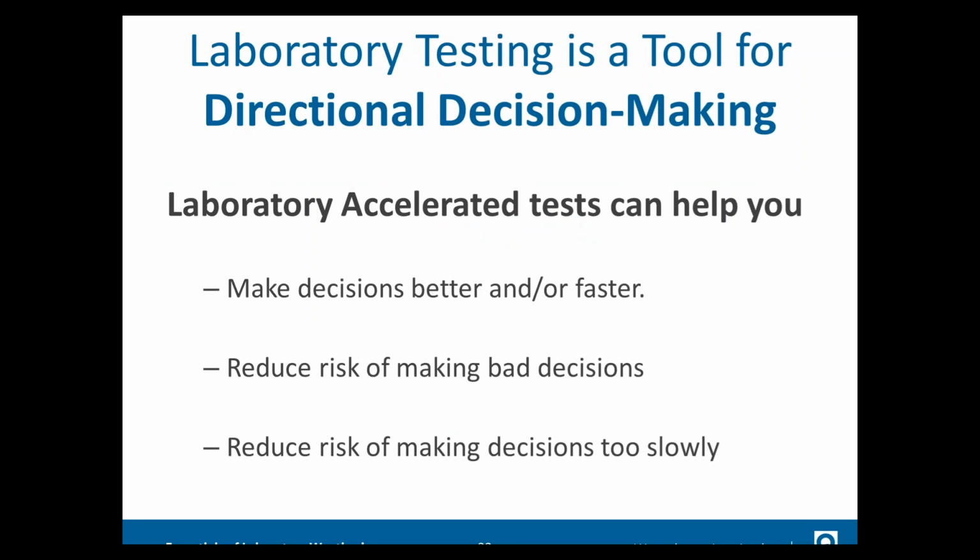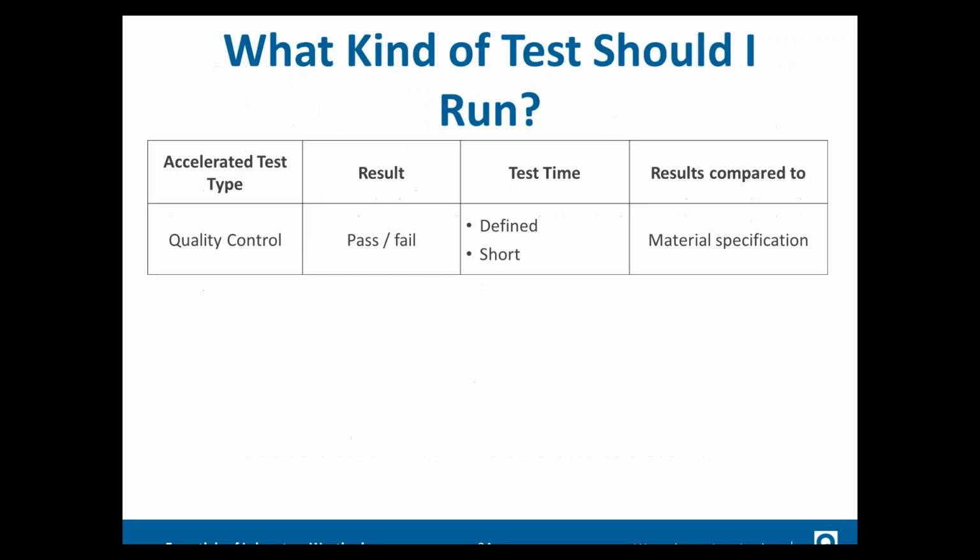But what's important to note about laboratory testing is that this is not a guaranteed solution for all applications. What it is, is a way for you to make decisions. Do I go with A or do I go with B? Should I make this more durable, less durable, or is it acceptable? It helps you make decisions faster. It helps you reduce the amount of risk associated with those decisions, and it allows you to get to market a lot faster. But it isn't a replacement for natural weathering.